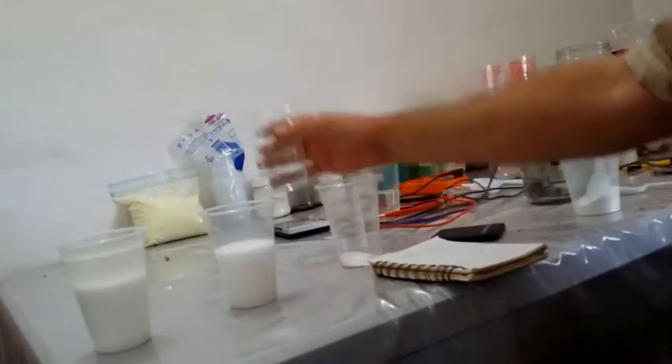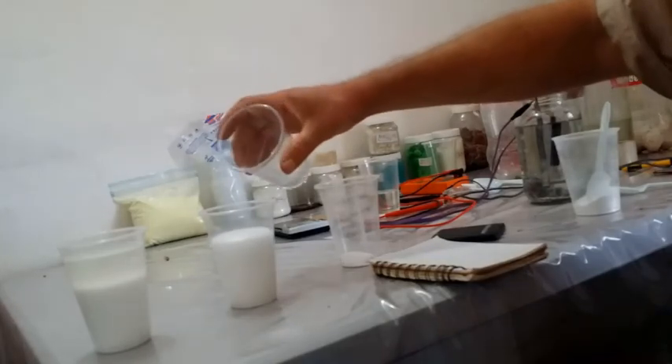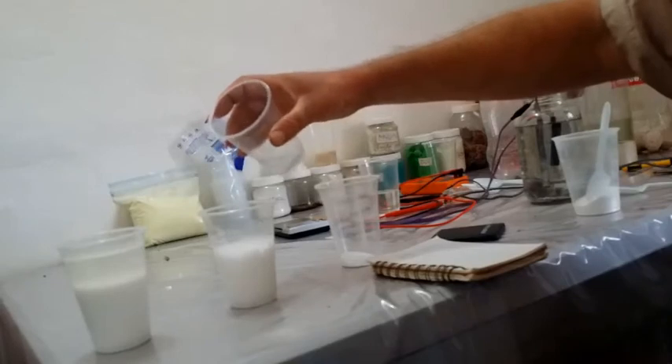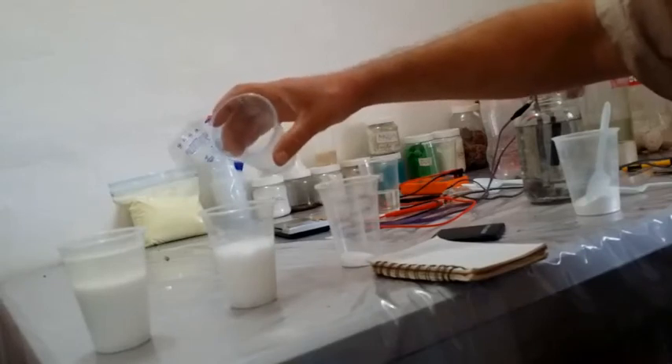Now a little trick: if it does boil over too much — like what it's going to do now — you can kill the bubbles with a bit more water. And that little bit more water is not going to hurt the reaction.